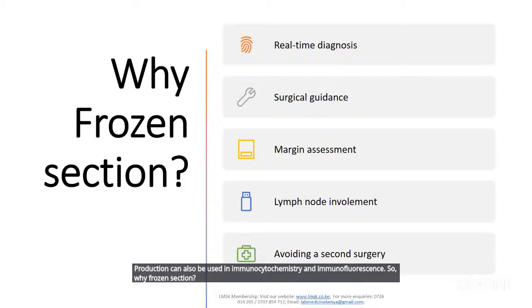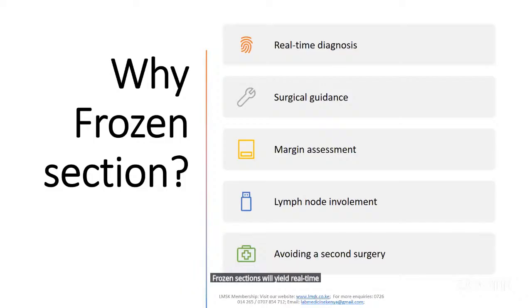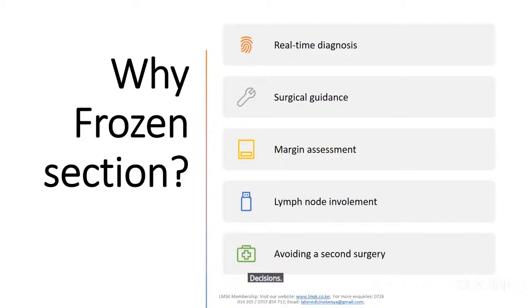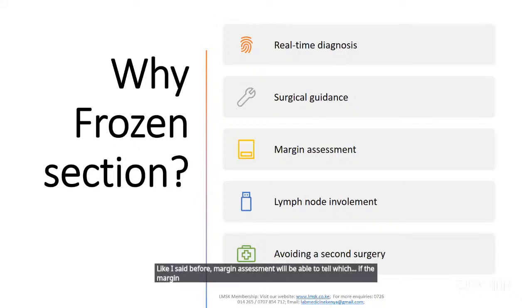Frozen sections will yield real-time diagnosis. They are very important because they guide surgical decisions. For margin assessments, like I said before, margin assessment will be able to tell which margin is positive or which margin is involved with tumor.